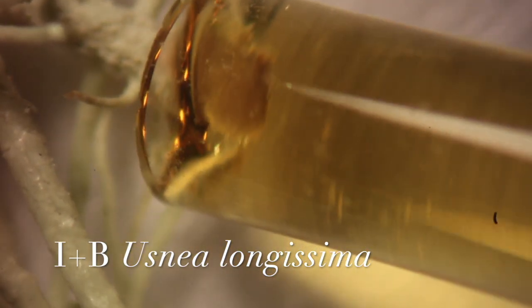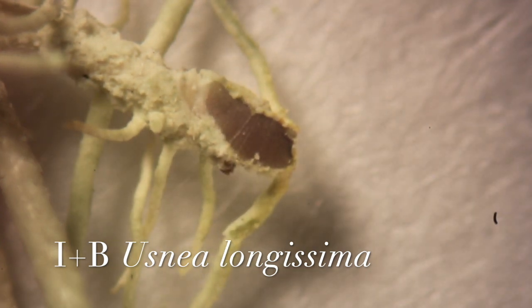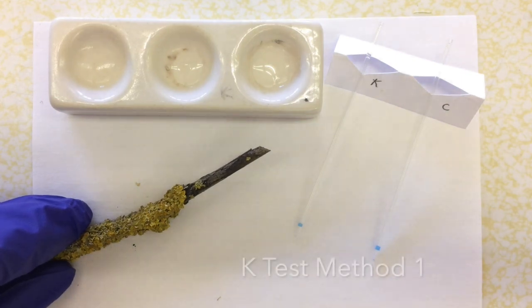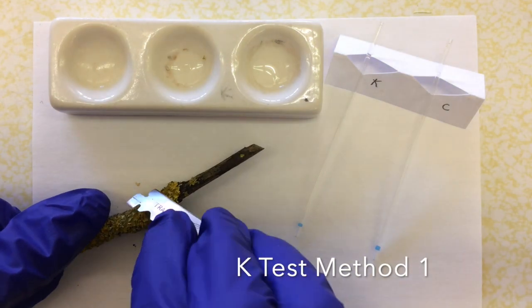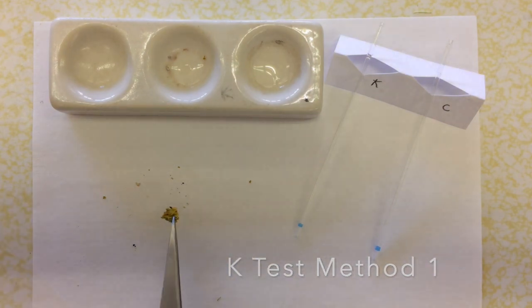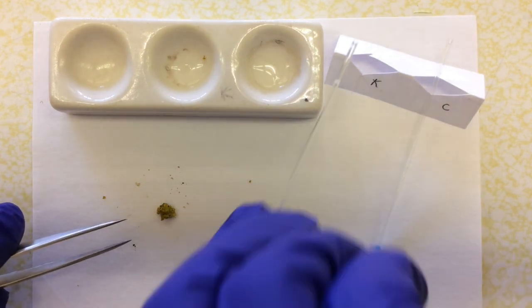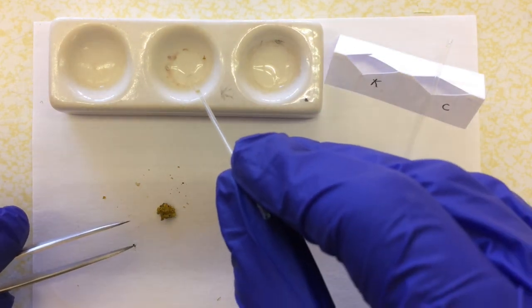Here you can see the medulla immediately turning blue, indicative of a positive reaction. Another method of spot testing is by using glass capillaries. This method can be useful if you're testing lots of samples at once. Let's see this and an example of the K test on a piece of Xanthoria.